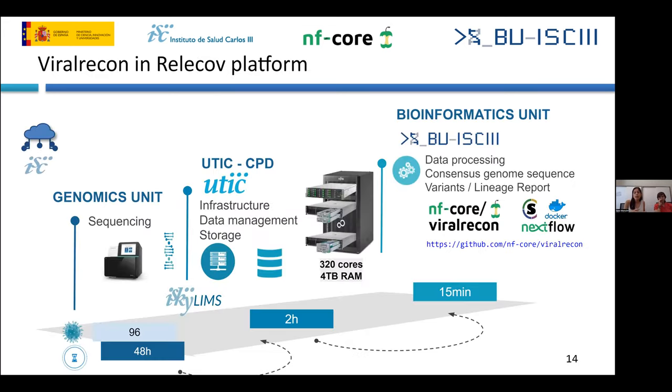This would be a general schema on how the samples are sequenced and analyzed here in the Institute of Health Carlos III. After 2 days of sequencing samples, they are going to be stored in a hard disk cabin and processed in a high processing computing server here in the Institute of Health using viralrecon. And then the results are going to be retrieved to the microbiology labs.